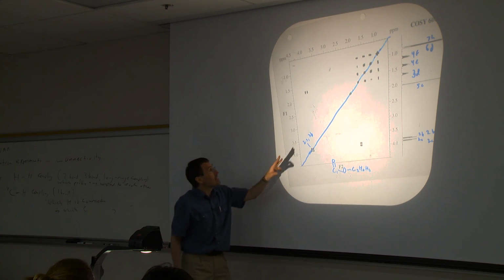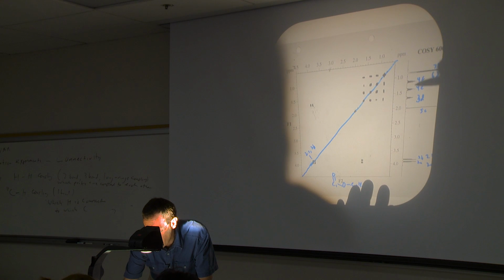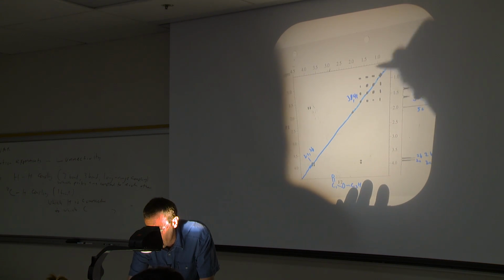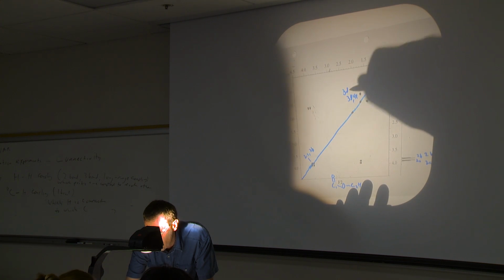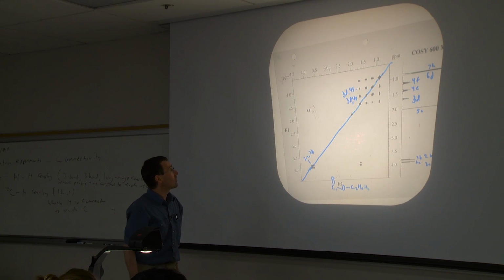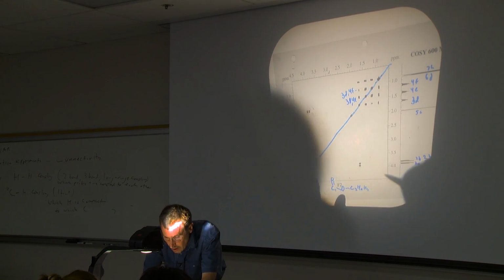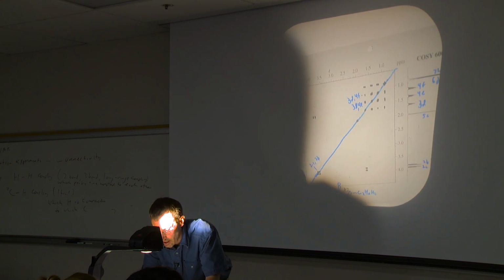All right, let us now build up the rest of the molecule. So we see a cross peak here, right? This is 3D, this is 4E, so we see 3D crossing with 4E, and this is 4F, we see 3D crossing with 4F. So that starts to be useful. Oh, I missed one cross peak here.